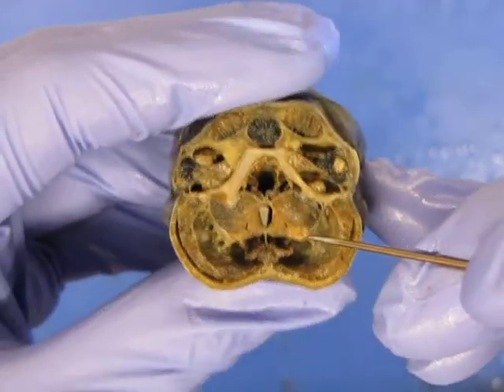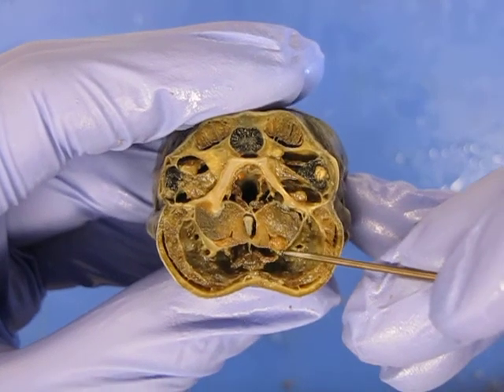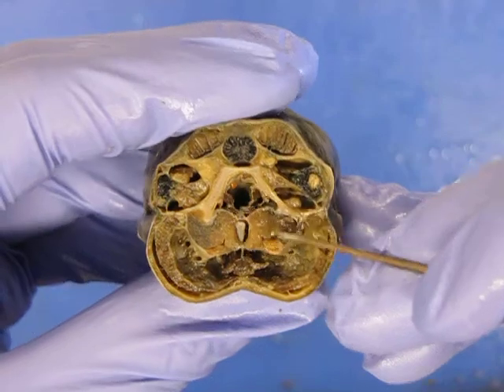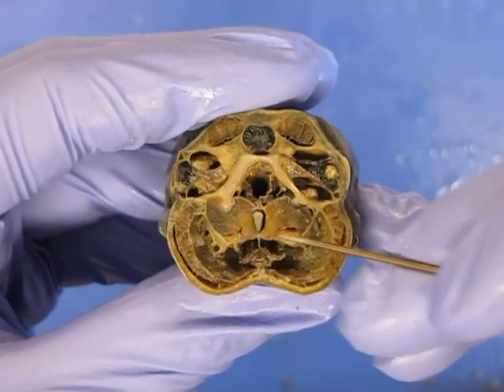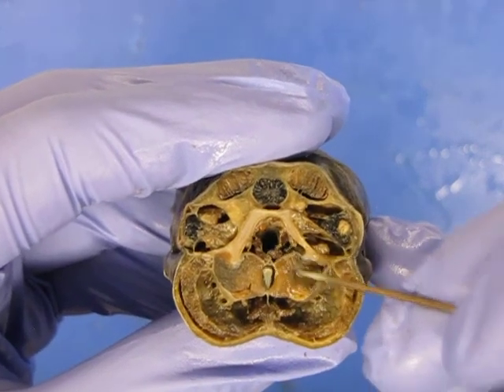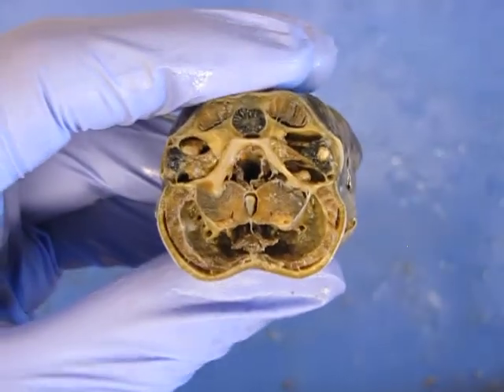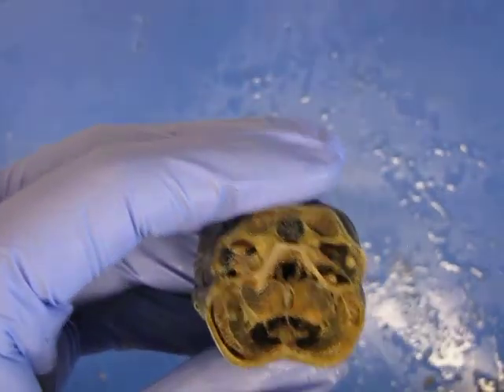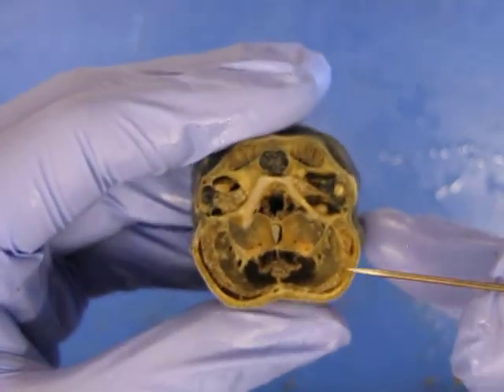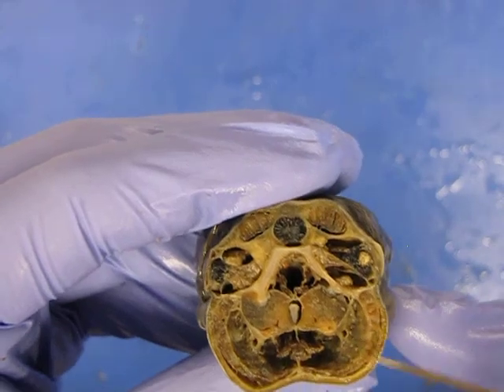But then on the right section, you'll also see this glandular tissue that is clearly separate from the muscle, but at first it might look part of it. Look for it, it's actually separate. And it's mushier. See, this is nice and fibrous muscle and mushy glandular tissue here. Those are the oral glands. So the oral glands are what produces the anticoagulant that helps keep the blood meal from the host flowing for the lamprey. Okay, this is all myomere muscle here.